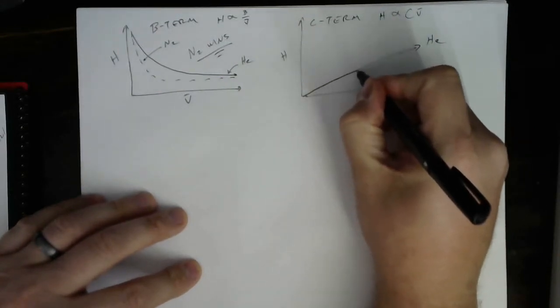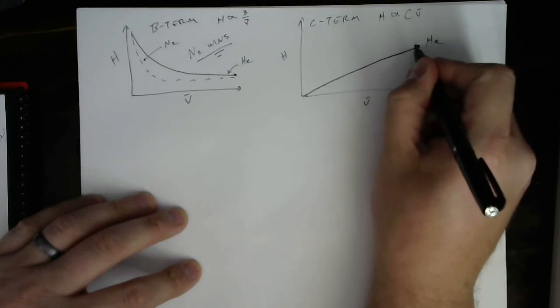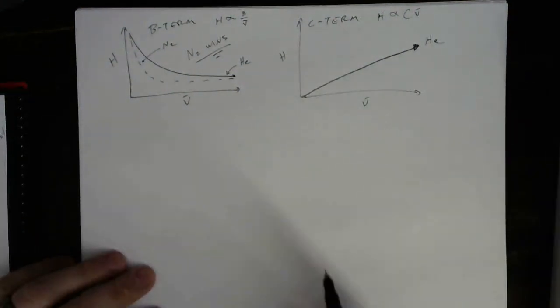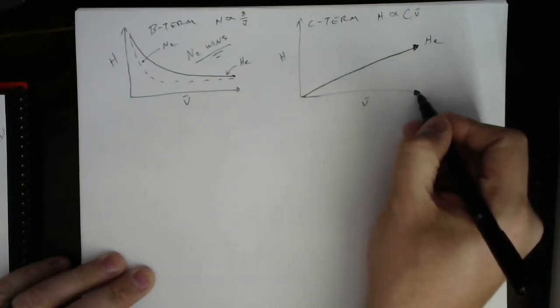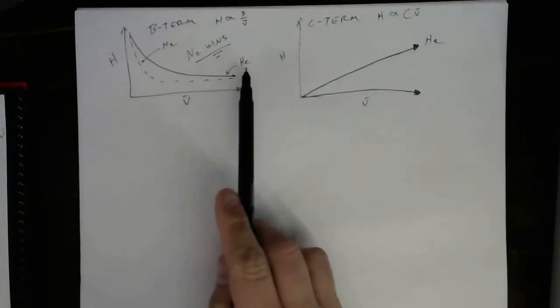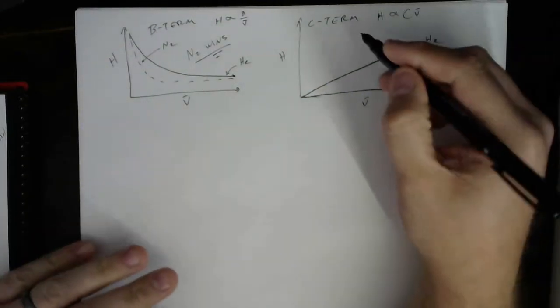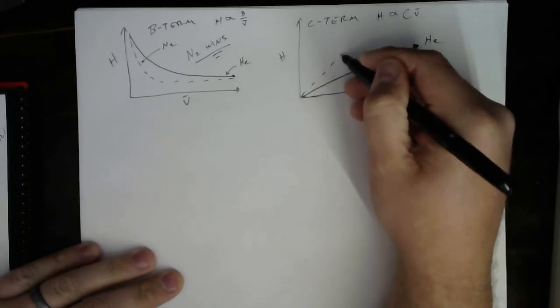It's all about how much time it takes for an analyte to find its way into and then back out of a stationary phase. And the faster something diffuses, the less time it takes, the better, right? So when an analyte has slightly faster diffusion in helium, it has slightly lower resistance to mass transfer. So if we were to plot this for nitrogen, it would have a higher slope like this.